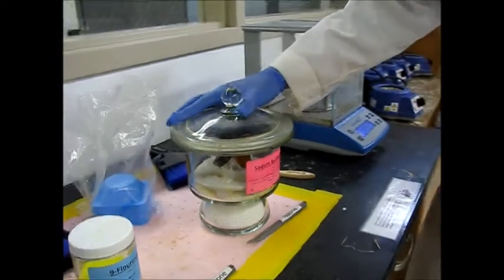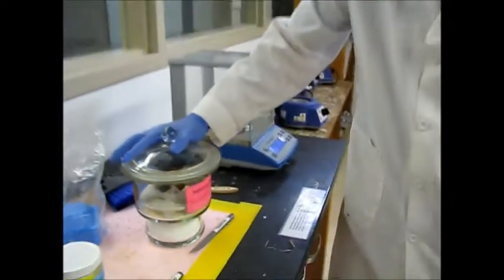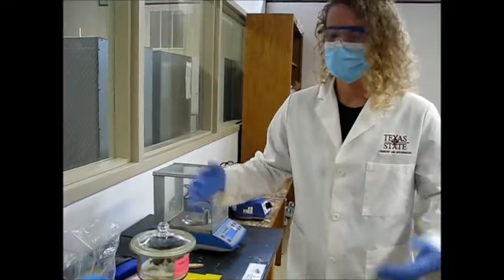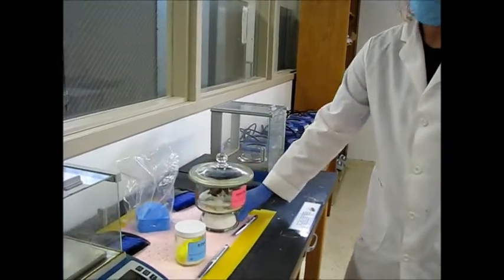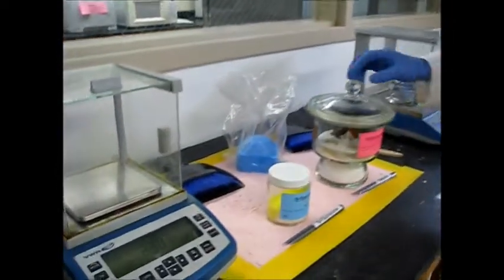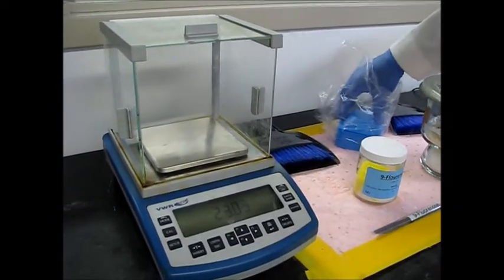Also do notice that we have sodium borohydride in this desiccator. That's because sodium borohydride is very hygroscopic and it will react with water in the atmosphere. So you can't just keep it in a jar like this. It needs to be sealed in its desiccator that will absorb all the water. So we're going to go ahead and measure out 200 milligrams of 9-fluoronone.